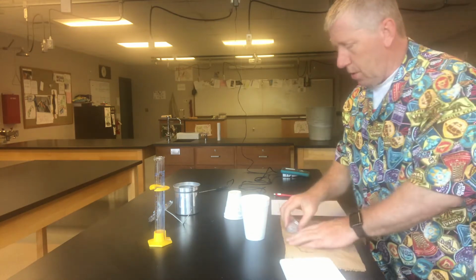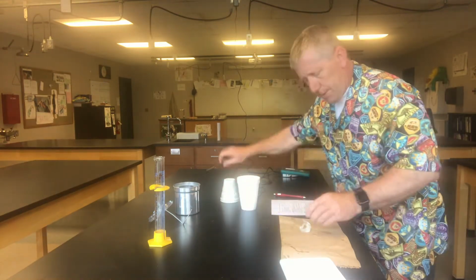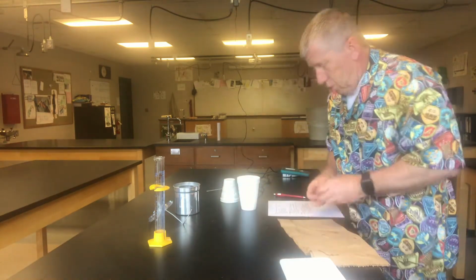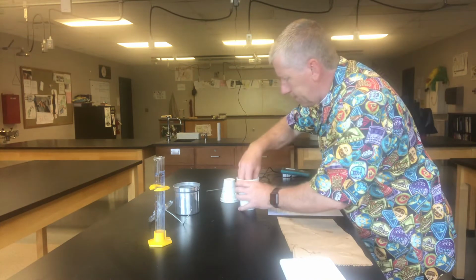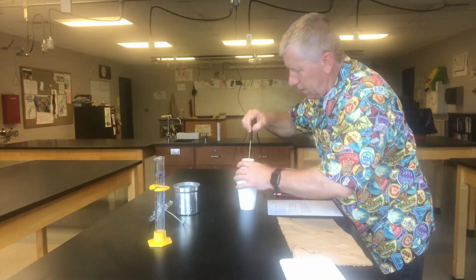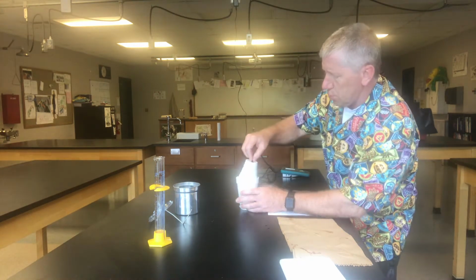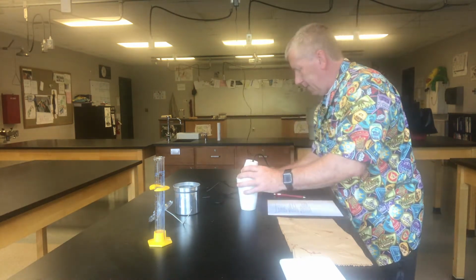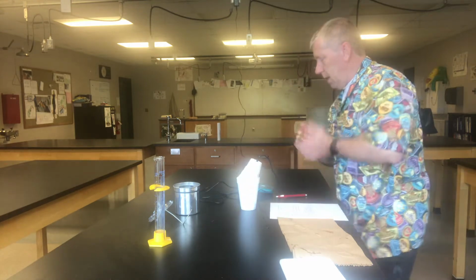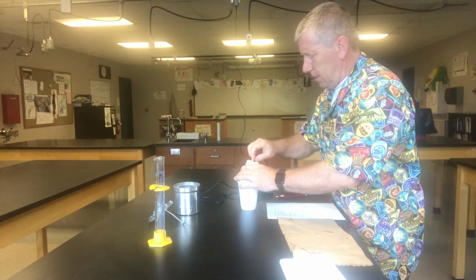Okay. I'm going to put this in, the top on. Put the temperature probe in. One ice cube. Okay, we want to get this in there, and then we're going to put the temperature probe in. I'm actually going to use the temperature probe as a mixing device. The water temperature is going down. I can't show that to you as we speak.